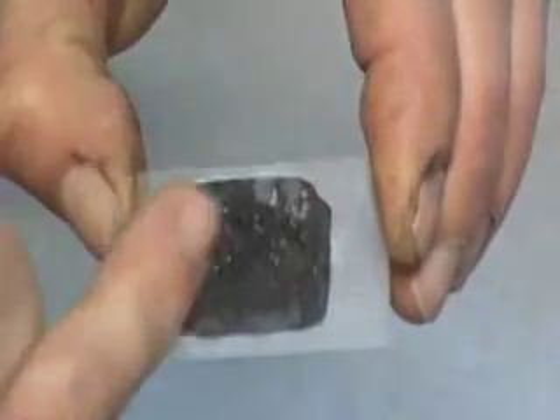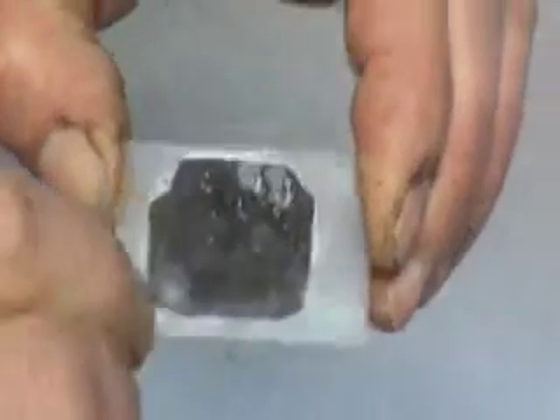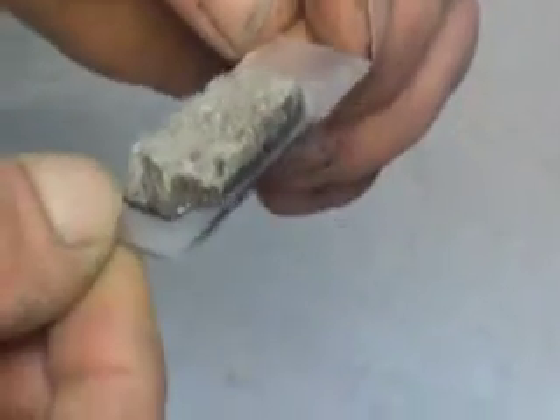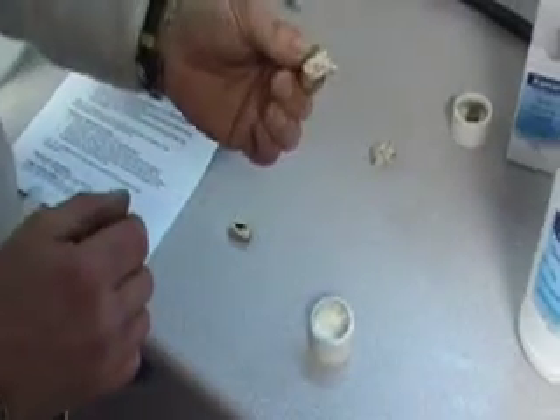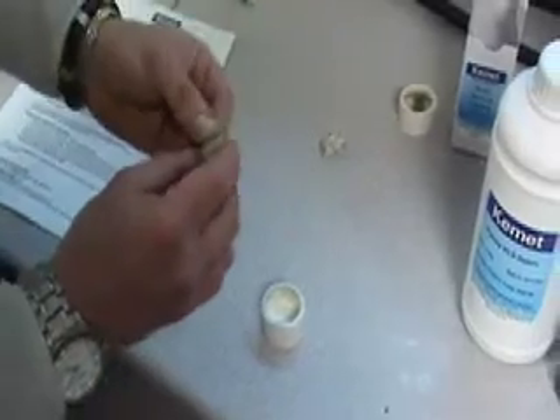Ensure there are no air bubbles on the bottom of the glued surface on the glass slide. This sample is now ready for the next procedure on the geoform. For porous rock samples, we have to adjust the technique of bonding.